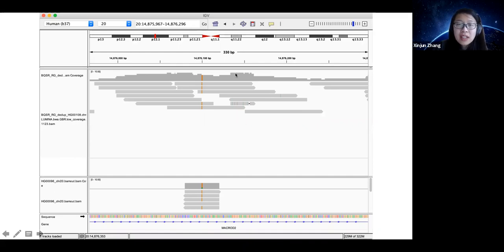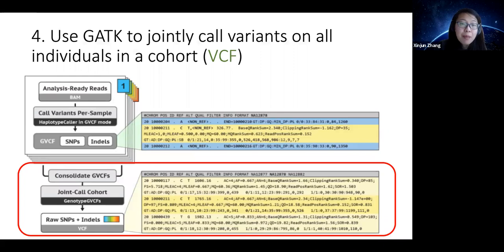It shows that for this particular part of the genome, the original BAM file may not look as good, so HaplotypeCaller reassembled this part. This is our original reads, and this is the reassembled part. You can zoom in and out and see all of these reassembled parts. This is just one way to do a sanity check later on. Otherwise, we should be happy at this moment.